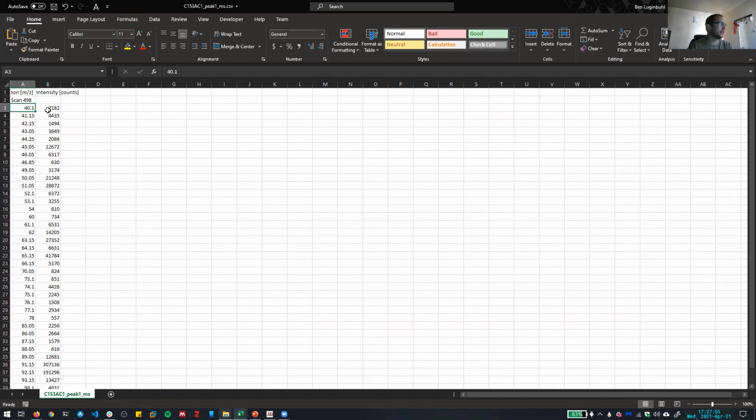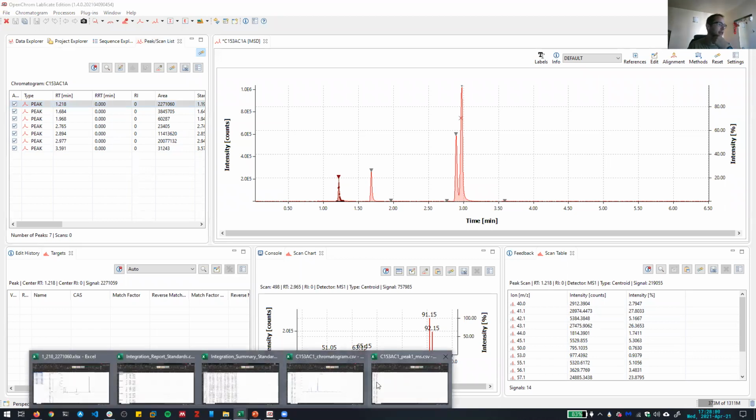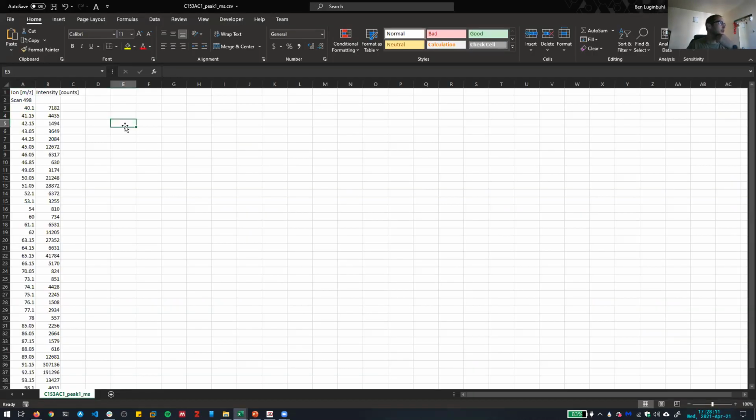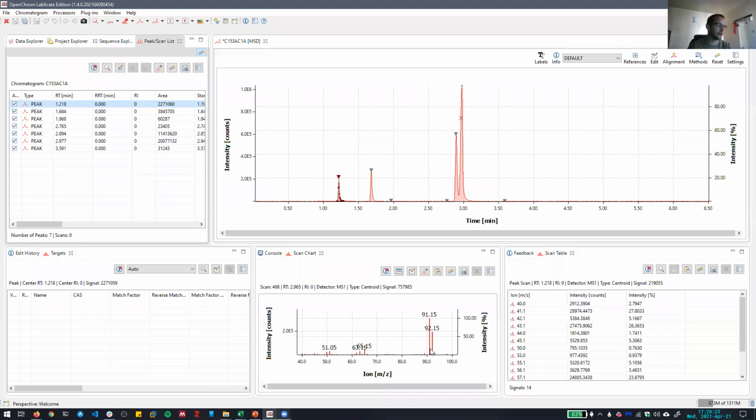So in order to generate a plot that actually looks like the one from here, we basically need to fill in the data between these and add those zeros back in. There's a way to do this in Excel, and I guess we can just go through it now as an exercise. So let's see, if we just plot these as is, anyone have an idea what kind of plot would be a good one to use for these kind of data? If we go back to this.